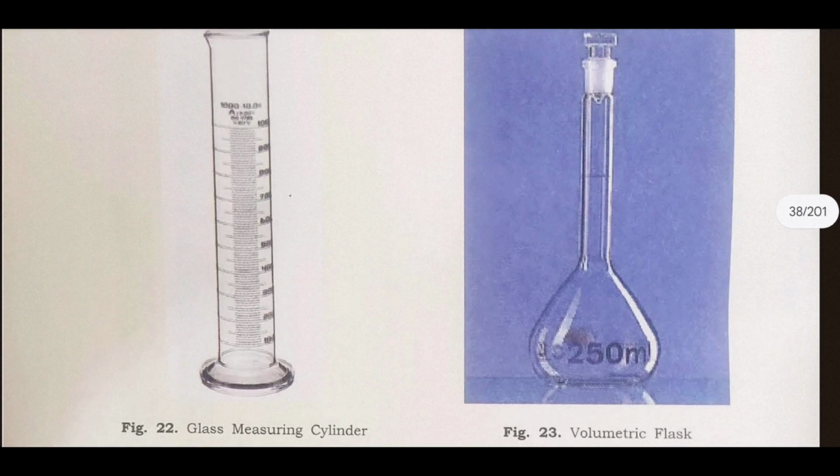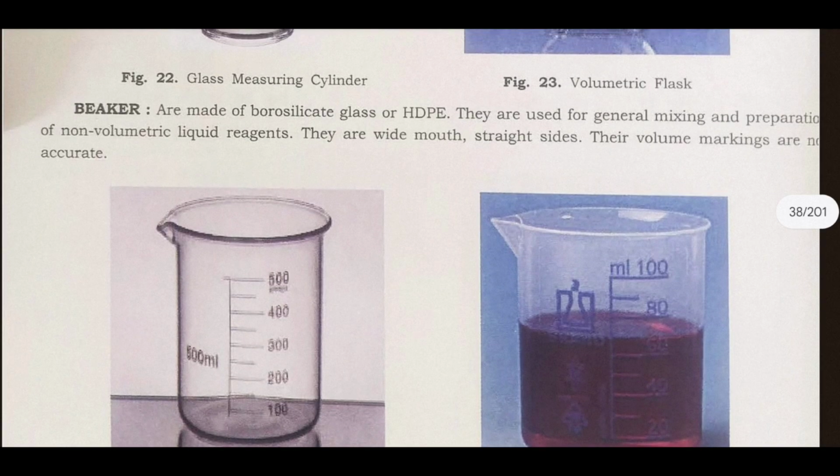Volumetric flask. Beakers are made of borosilicate glass or HDPE.